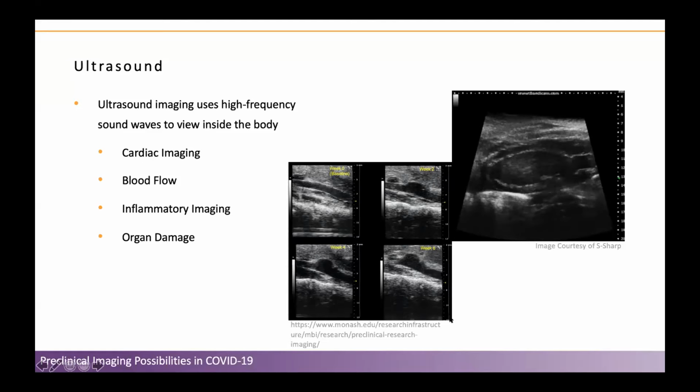So this is a genetic defect where people are susceptible to these abdominal aortic aneurysms. And this is actually a group that is at particularly high risk with COVID due to the increased cardiovascular abnormalities. So this is an interesting example of tracking the size and shape of that in vivo using ultrasound.